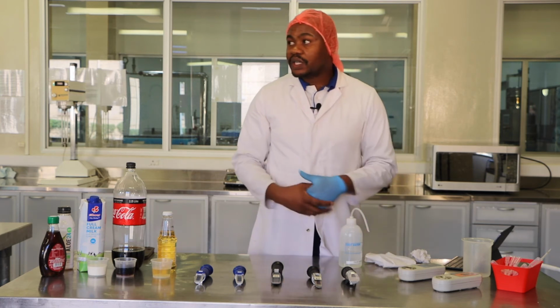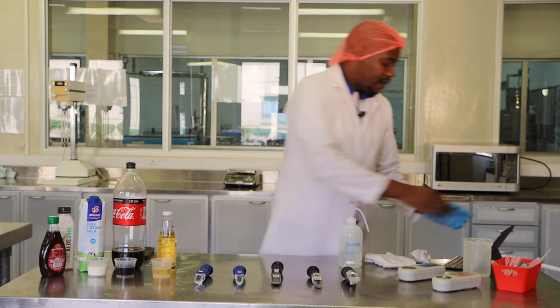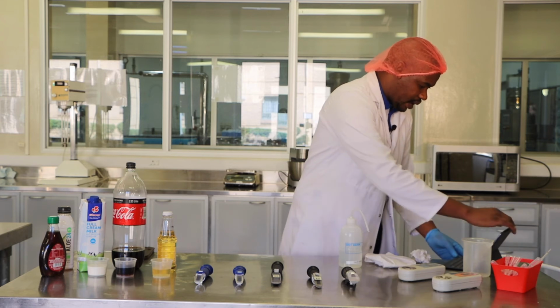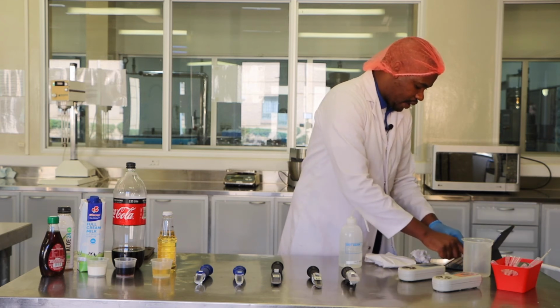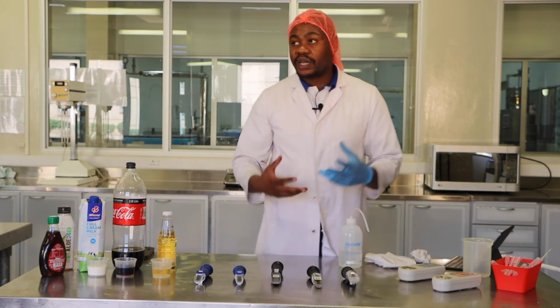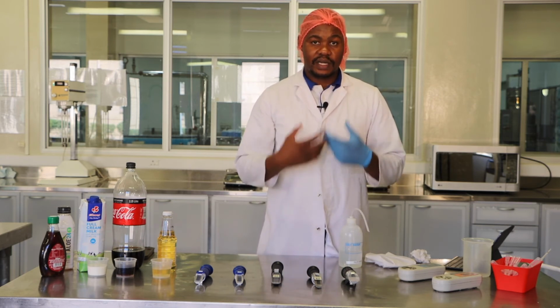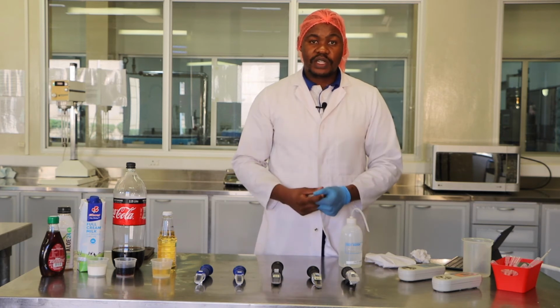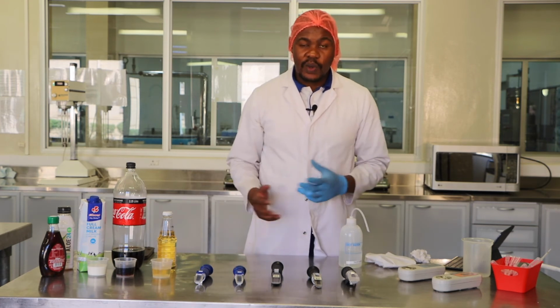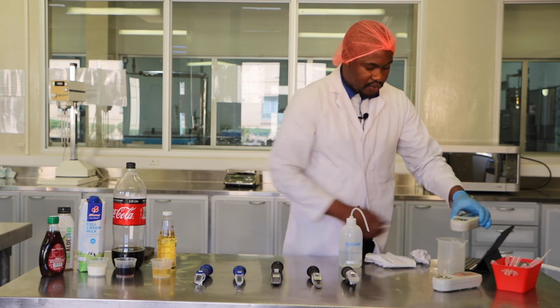And then according to this refractometer, I've got a sugar concentration of 0.1. Then I'm going to go to my digital notebook and punch in 0.1. It's always important that when you get a reading in the laboratory, you record your results. If you don't use a digital notebook, you can also use a manual notebook. That's where we all start. It's not a problem.